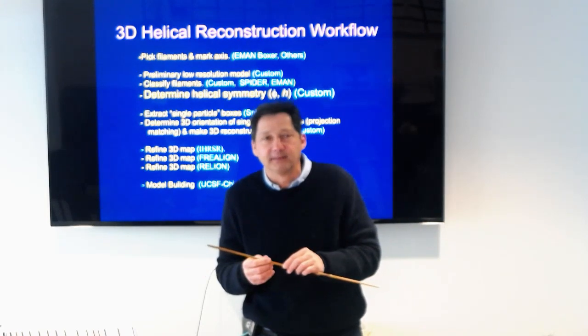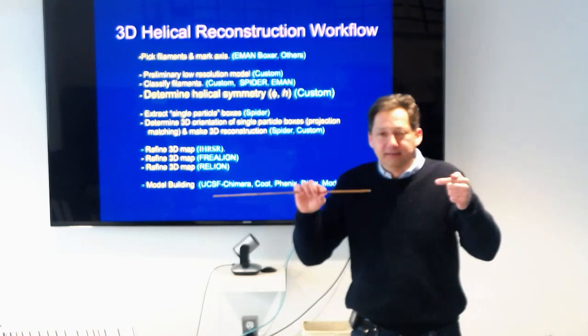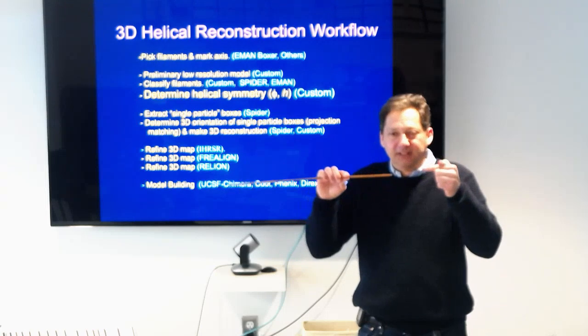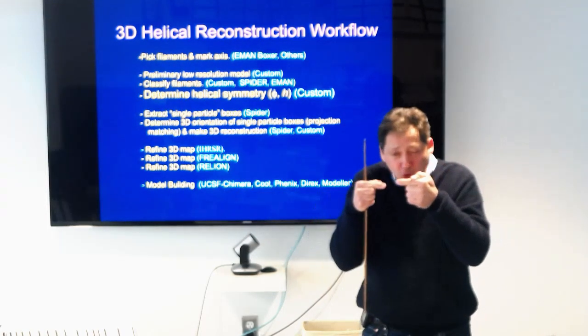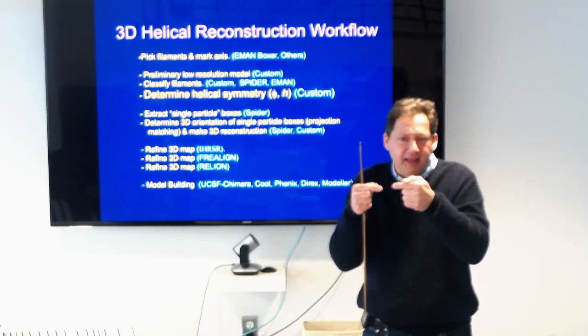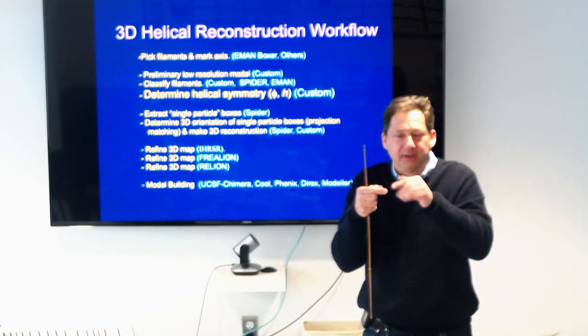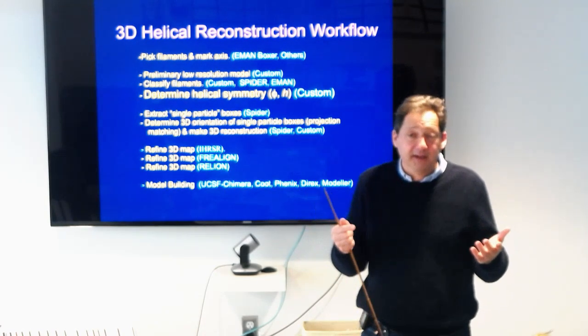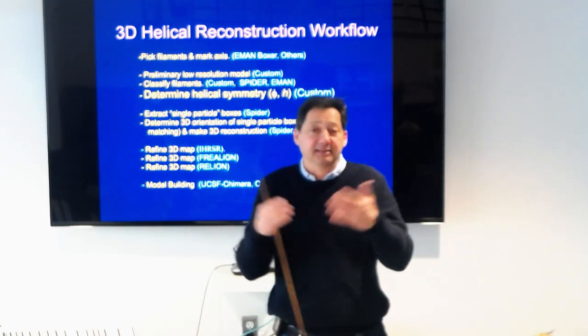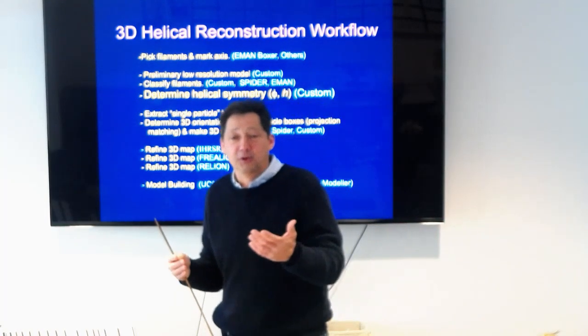And there are many reasons for having the wrong symmetry. Historically, one of them is that sometimes, when you see the diffraction pattern, the off-meridional layer lines are so close to the meridian that they look like a meridional, particularly if the specimen is a little bit tilted. So some people say, oh, that's a meridional, that's the subunit spacing, and then they get the whole symmetry wrong.